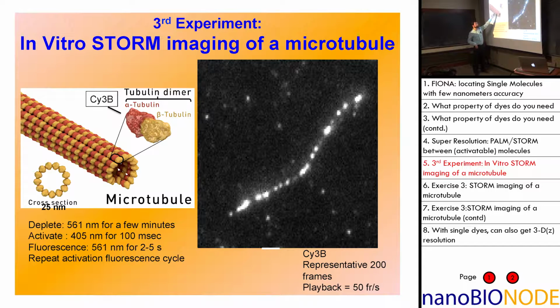Because if you just lay some of this down and you attach a dye to what is called the tubulin dimer, and you shine light at it, what width will you think is the width of this? Lambda over 2. Lambda over 2, because it's exactly that.